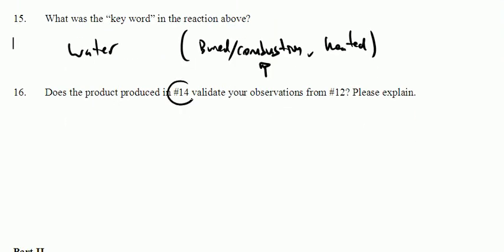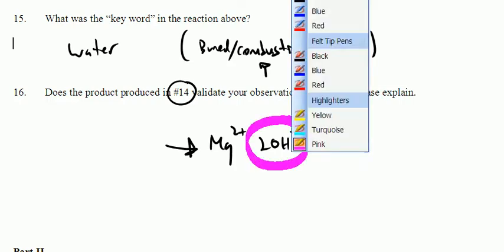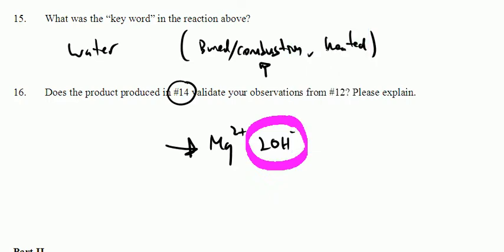Does the product in number 14 validate your observations? Well, our product was our presence of hydroxide, and we did get a pink color. So, yes.